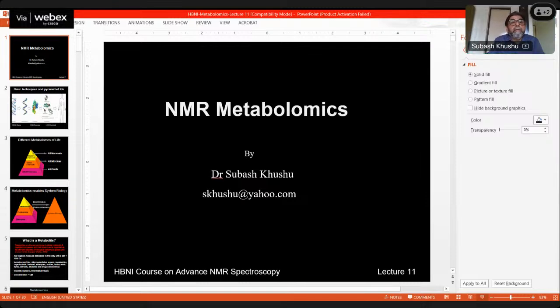If you look at the comparison between LCMS and NMR, the detection limit, as I said, is not as good as MS, where one can pick up picomolar concentrations through mass spectroscopy, whereas in NMR, you can go up to millimolar or micromolar concentration. Of course, you can go to nanomolar if you use cryogenic probes, which have very high sensitivity of detection.